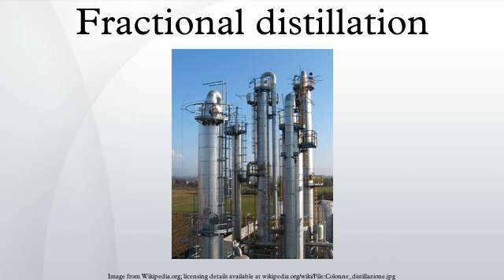The efficiency in terms of the amount of heating and time required to get fractionation can be improved by insulating the outside of the column in an insulator such as wool, aluminium foil or preferably a vacuum jacket. The hottest tray is at the bottom and the coolest is at the top. At steady-state conditions, the vapor and liquid on each tray are at equilibrium. The most volatile component of the mixture exits as a gas at the top of the column. The vapor at the top of the column then passes into the condenser, which cools it down until it liquefies. The separation is more pure with the addition of more trays initially.